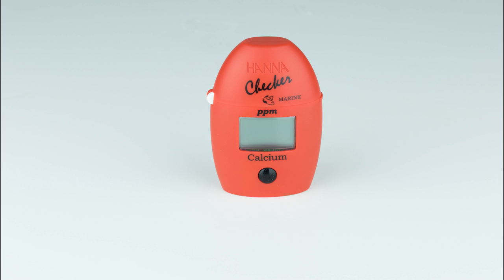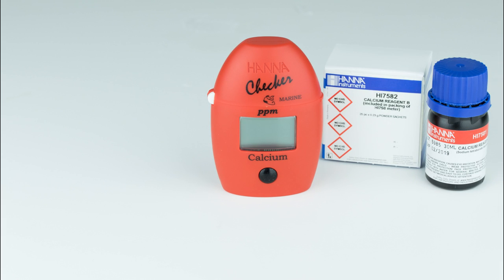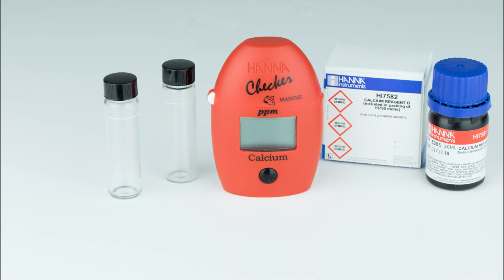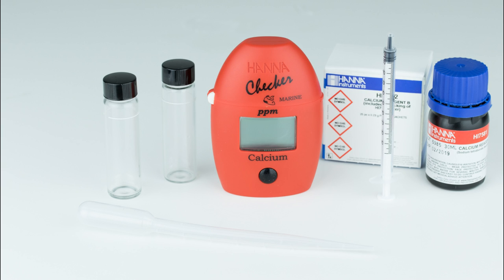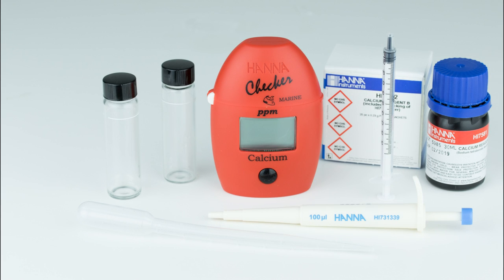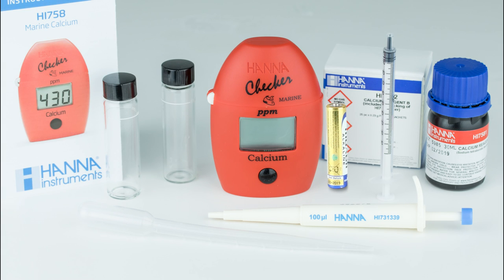The HI-758 kit comes with everything you need to begin testing: reagents for 25 tests, two sample cuvettes with caps, one 1 mil syringe with tips, a plastic dropper, one 0.1 mil mechanical pipette with tips, one AAA battery, and the instruction manual with reference guide.